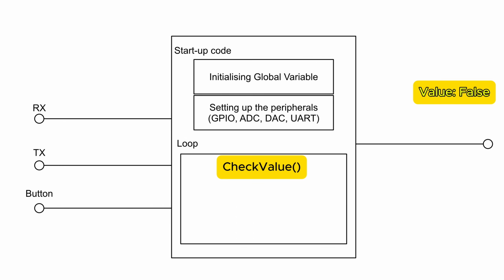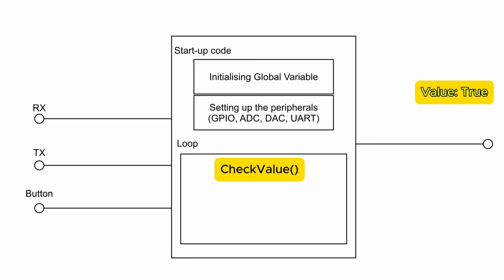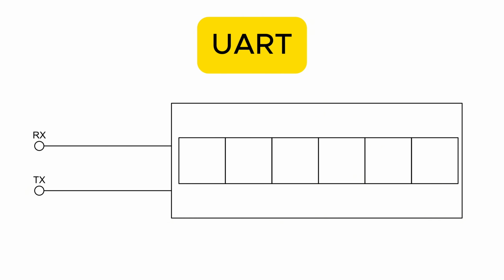With this approach, we use the loop as the checker if there are any changes invoked by the interrupt, and execute certain code when needed. That way, the device can work more precisely and adaptively. Best of all, this strategy keeps our interrupt service routine incredibly lean, reducing stack size and preventing system crashes. Moving on to communicating with our devices.